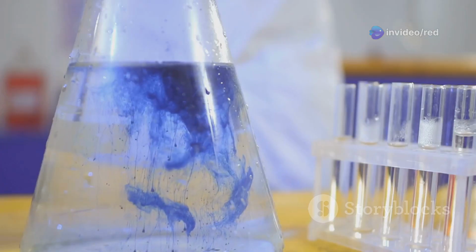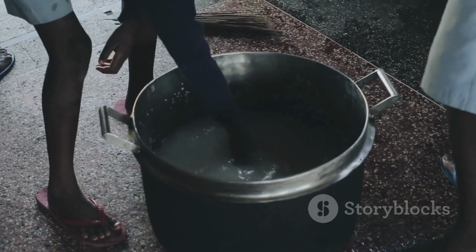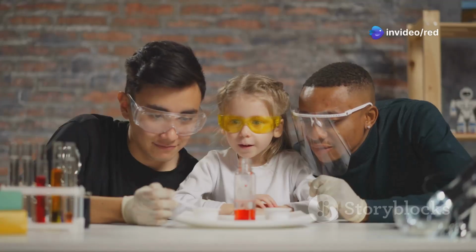Potassium hydroxide is a base. That means it can react strongly with other substances like our friend, water. What happens when these two meet? Get ready for some chemistry excitement.